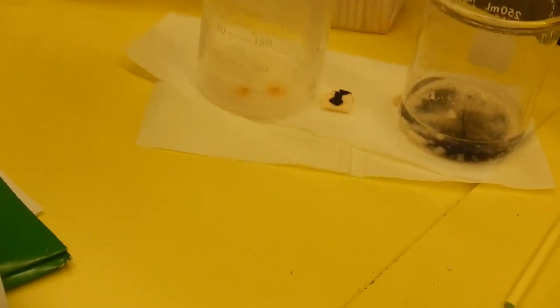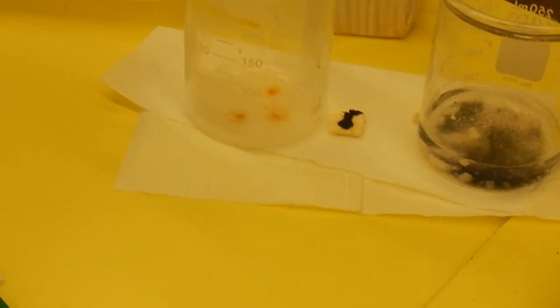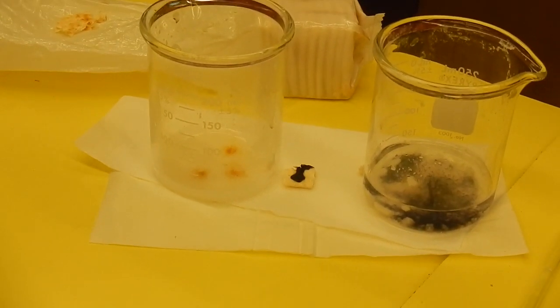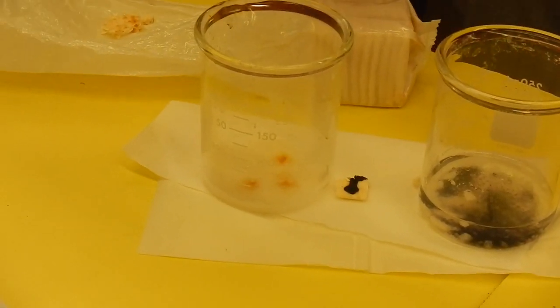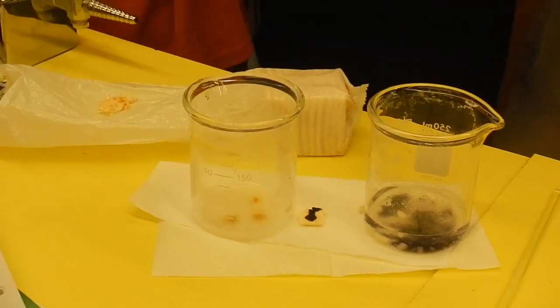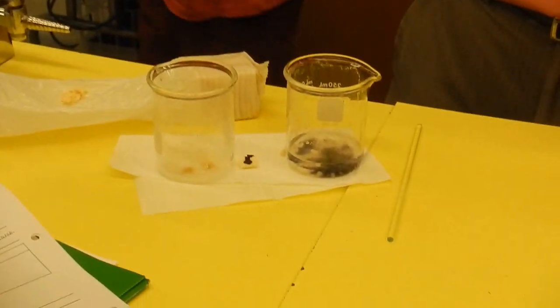And so let me put this one on the white background as well. Is it digested? Well, let's find out. Same color. Oh, it's digested. Same color, so it stays that same color. You see that there's little bits of blue-black in this one because we didn't wait long enough for the entire cracker to get digested. So it did find some starch, but in general, it found digested bits.